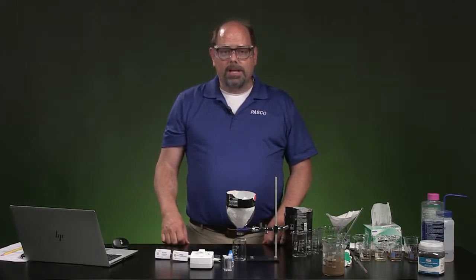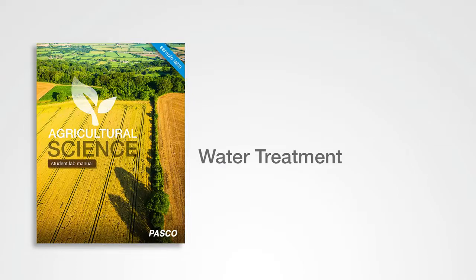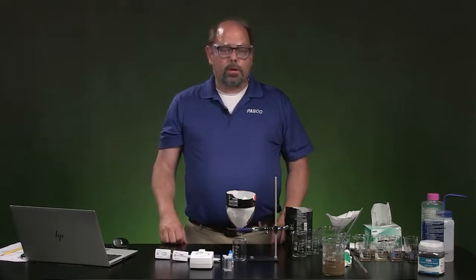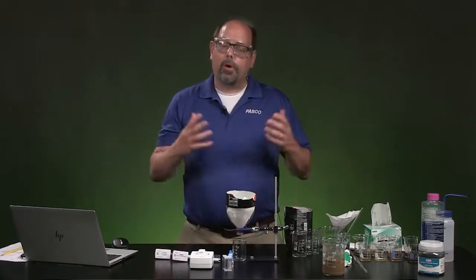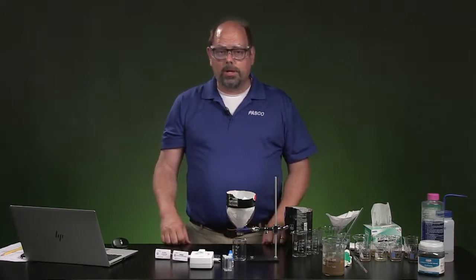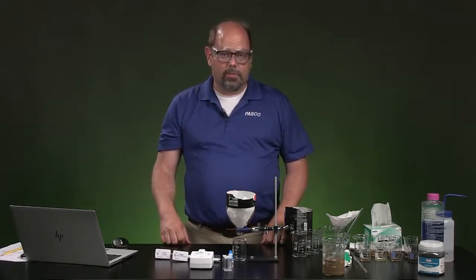That's what you're going to explore today when you get into the lab for this agricultural starter lab station. Water treatment. Your city takes quite some time to make sure that the water that shows up at your house is clear of particles and has been cleared of any kinds of disease. And so they're going to do several steps along the way.